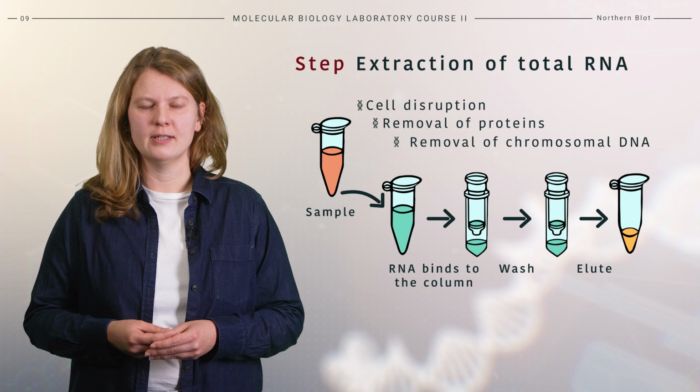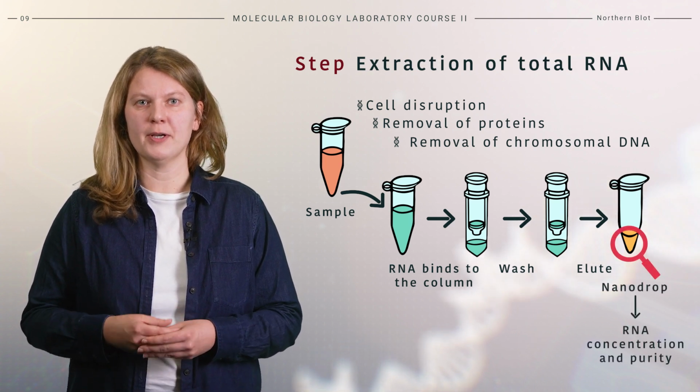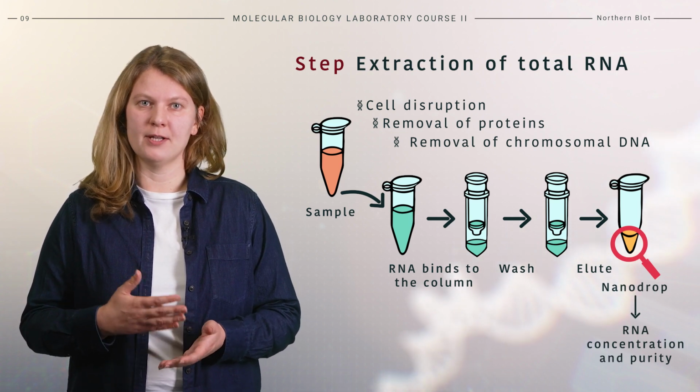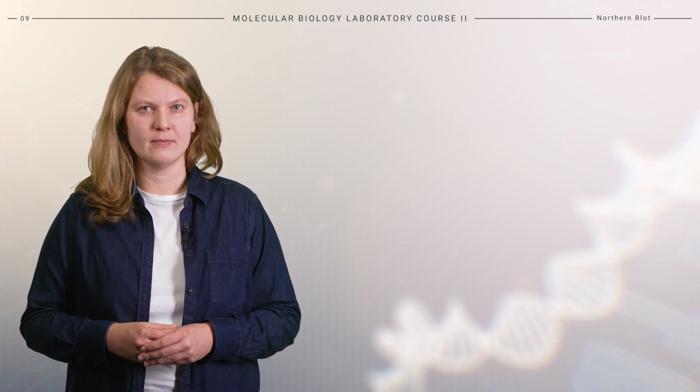After the isolation, the concentration and purity of RNA are determined by a nanodrop spectrophotometer. This is done by measuring the absorbance at 260, 280, and 230 nanometers.